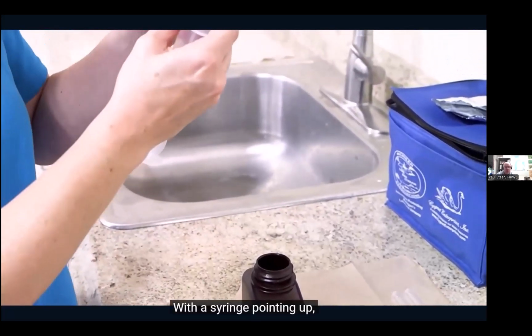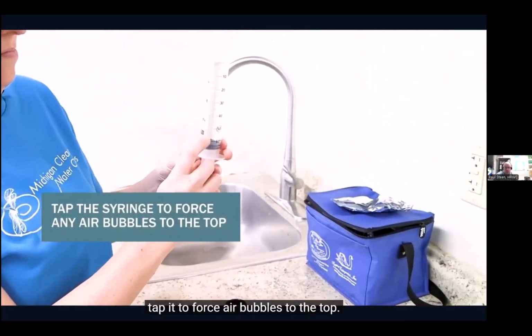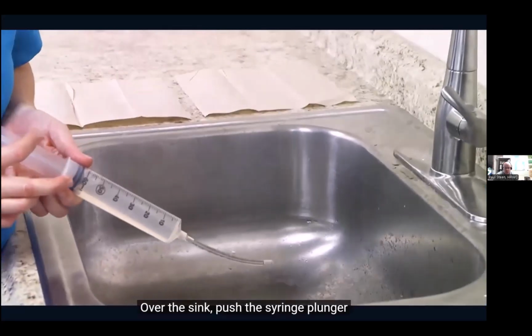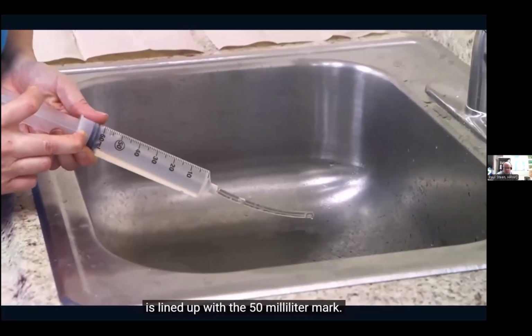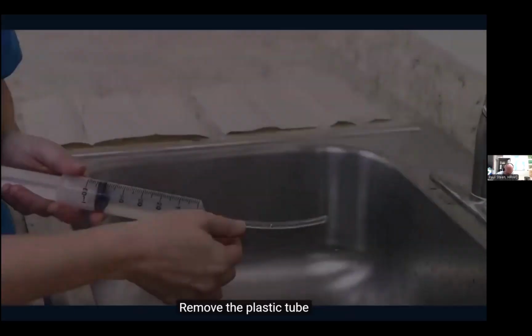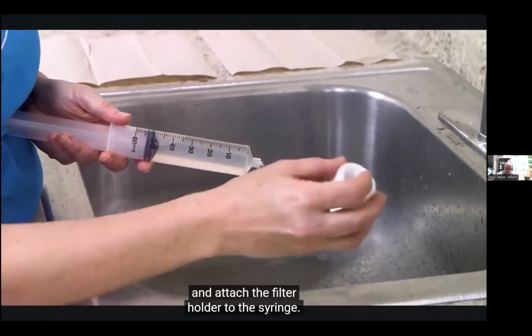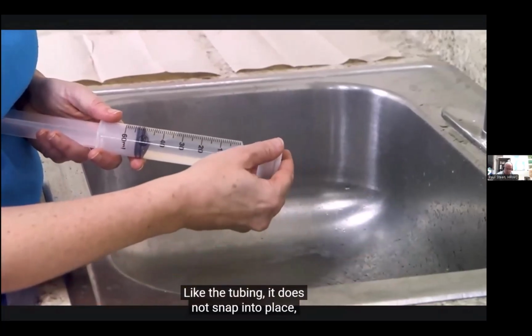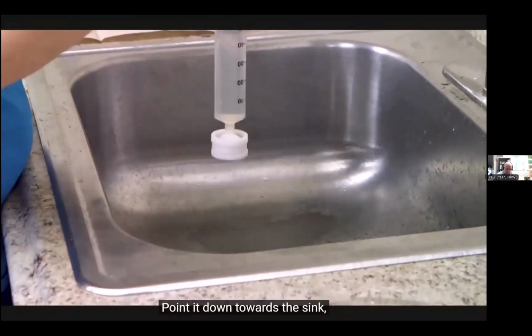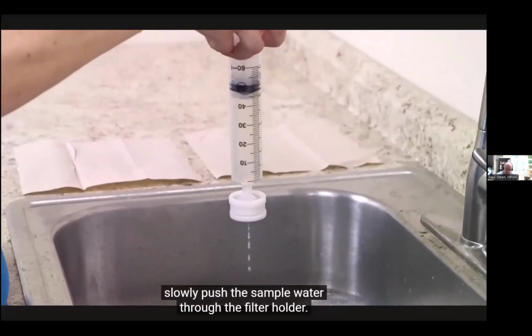With the syringe pointing up, tap it to force air bubbles to the top. Over the sink, push the syringe plunger until the end of the plunger is lined up with the 50 milliliter mark. Remove the plastic tube and attach the filter holder to the syringe. Like the tubing, it does not snap into place, but you can get it to fit snugly. Point it down towards the sink. Slowly push the sample water through the filter holder.